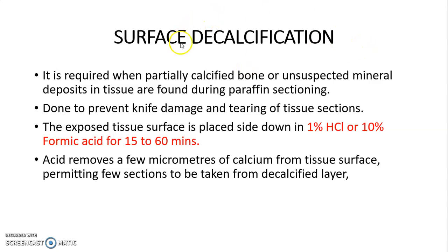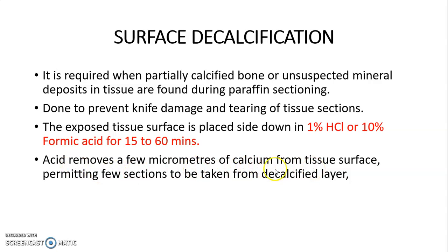Surface decalcification is required when partially calcified bone or unsuspected mineral deposits in tissue are found during paraffin sectioning. It is done to prevent knife damage and tearing of the tissue section. The exposed tissue surface is placed face-down in 1% HCl or 10% formic acid for 15–60 minutes. The acid removes a few micrometers of calcium from the tissue surface, permitting a few sections to be taken from the decalcified layer.